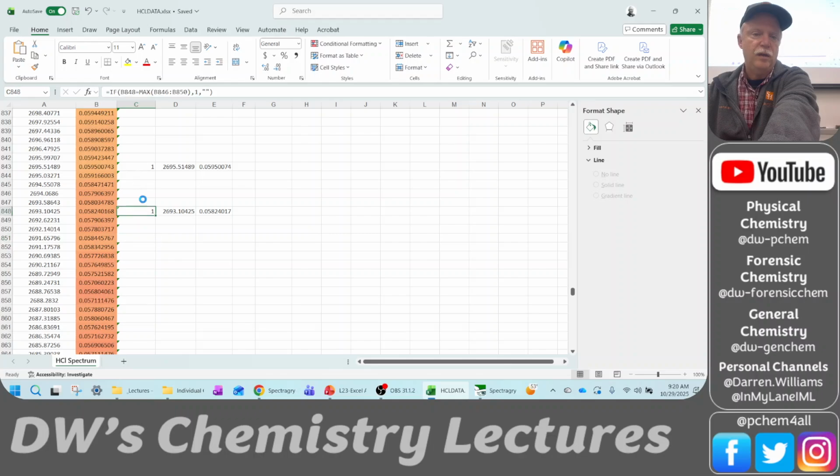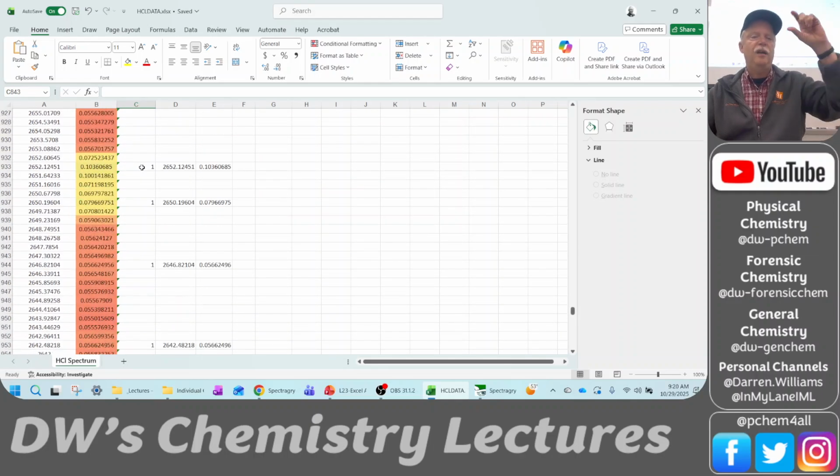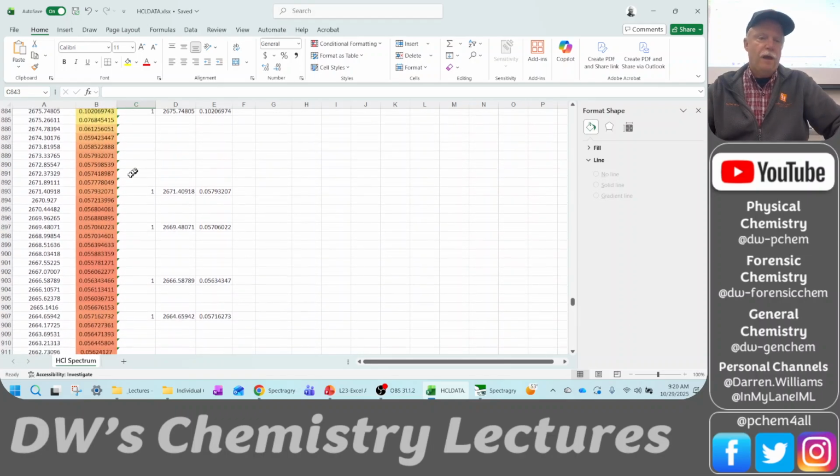Okay. So the ones that are in the red region, we can automatically just delete, yeah. And that's if you've done lots of little panels, okay? Because then the red ones truly are noise, yeah.